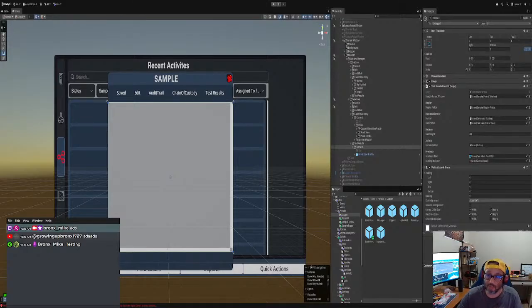So we'll do it step by step, so as not to get confused. Even if you're a professional, you're still going to want to do things step by step. It's going to be confusing. You want to go through a checklist. Does that make sense?